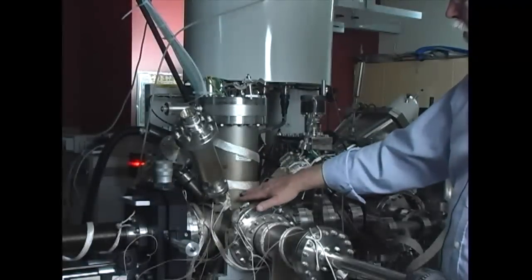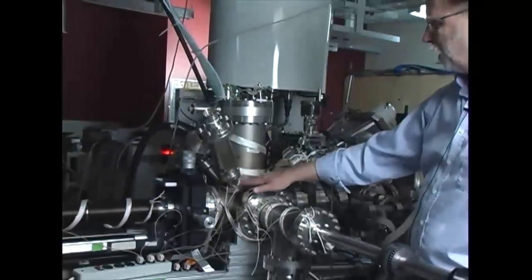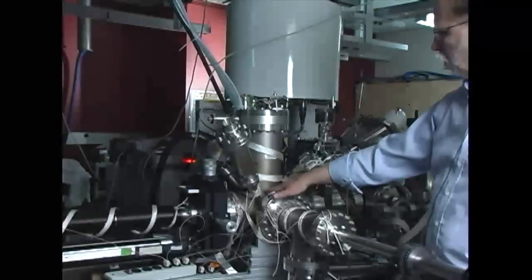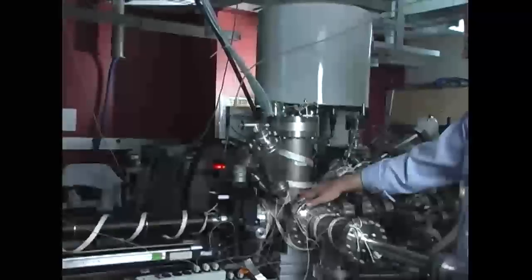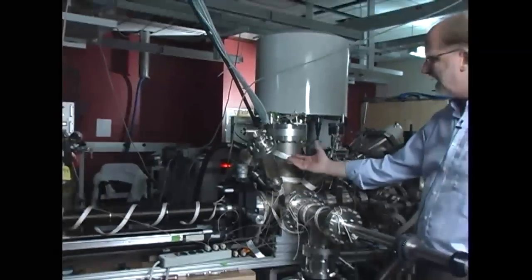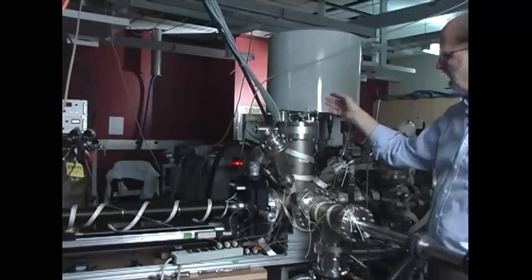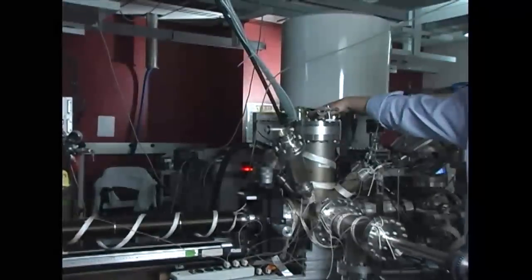So in the center of this chamber is a sample that's situated on this rod, which can be heated and cooled. This is situated at the focal point for an electron beam along this column right here to illuminate the surface, and the backscattered electrons, which again are very surface sensitive, will form a diffraction pattern that we'll go ahead and take a digital image of right here.